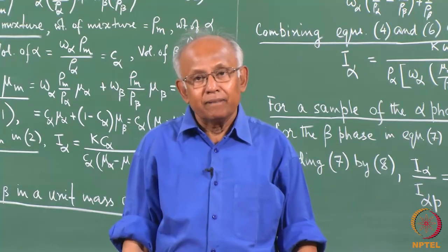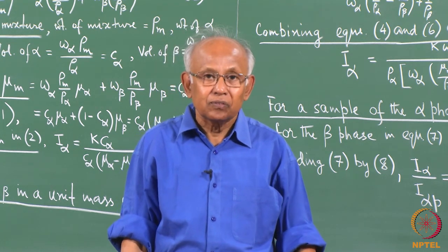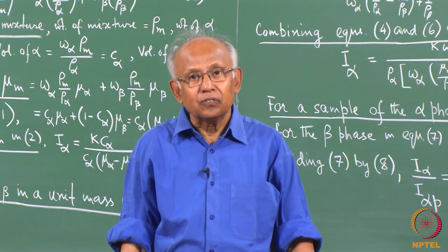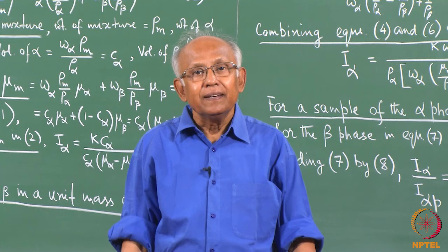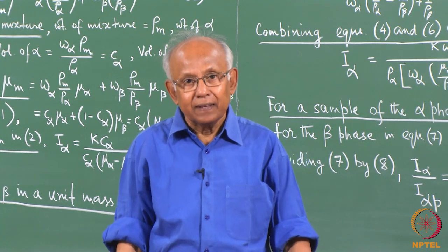We have seen that every substance, whether an element, a solid solution or a compound, has got its characteristic X-ray diffraction pattern.